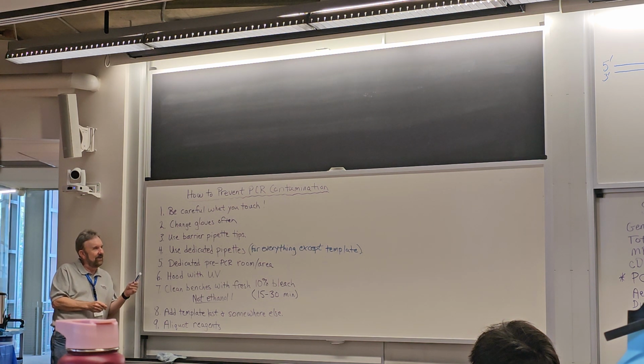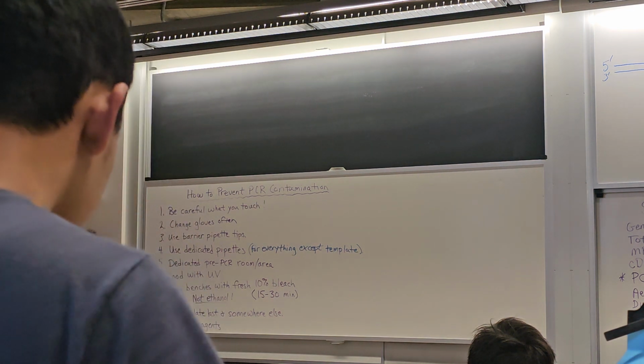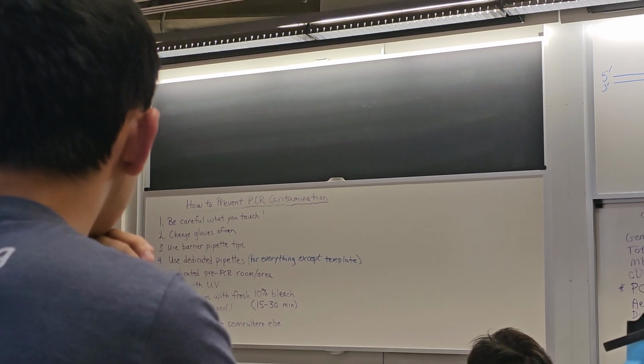You've got your dedicated area, you've got your dedicated pipettors, you've got your hood with UV. Again, I'm terrible on this. I guessed how much these cost a couple of years ago, and I was really off. So it's more than I thought, but maybe $1,000 and a couple $1,000. You're going to save that in a pretty short amount of time, in the amount of reagents and research time you're going to save by reducing your contamination.